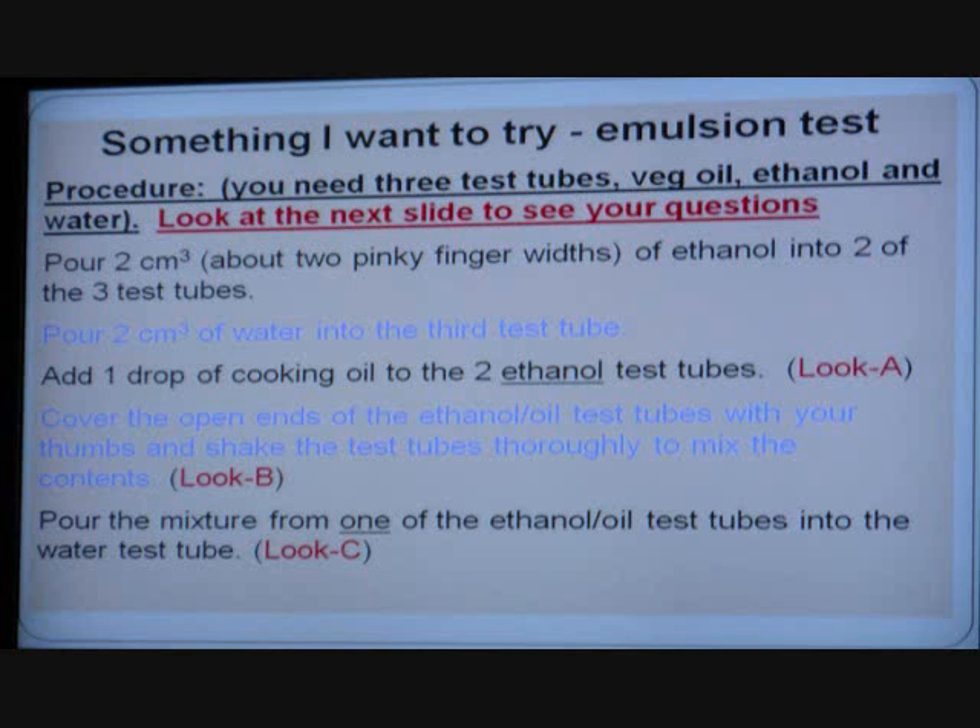I'm wondering about how to make an emulsion. An emulsion is where you mix two liquids together and one liquid doesn't dissolve in the other. When I put this oil in water and shake it, that should be an emulsion. If I let it sit long enough, it's going to separate back into fat and water. This is where the alcohol comes in — I'm going to try it and see what happens.